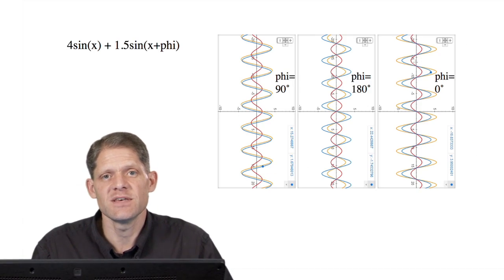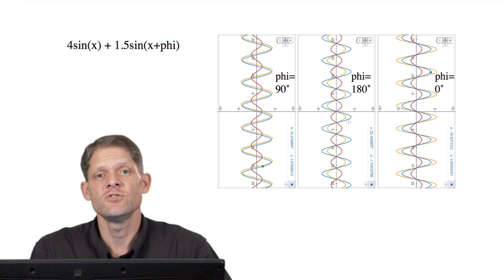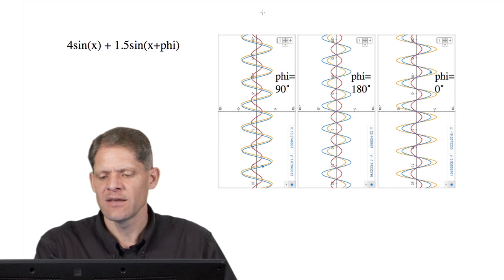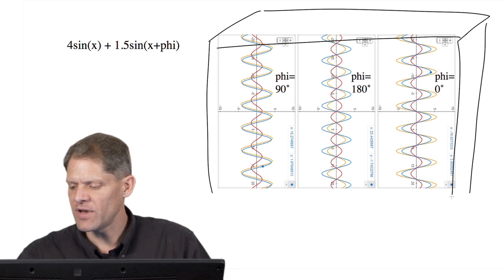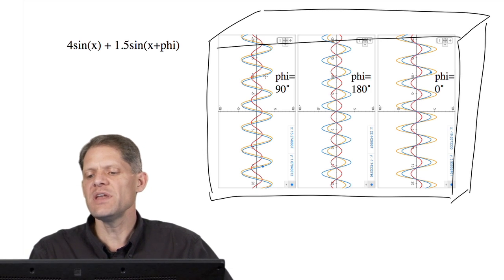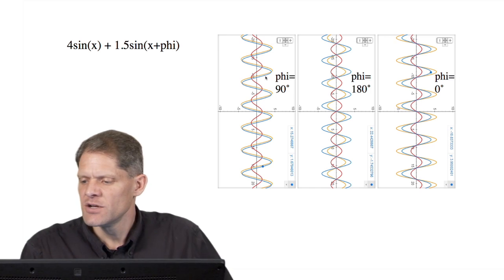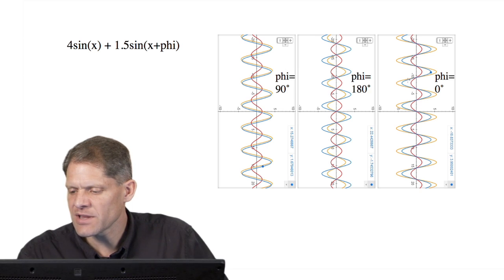Now, to understand why this is the case, let's consider 3 different scenarios for how 2 electron waves could add together. And what I want you to imagine is that this is all happening within 1 pixel of a detector in an electron microscope, for instance. And this plot and this plot and this plot are 3 different scenarios about how 2 electron waves could be adding together.